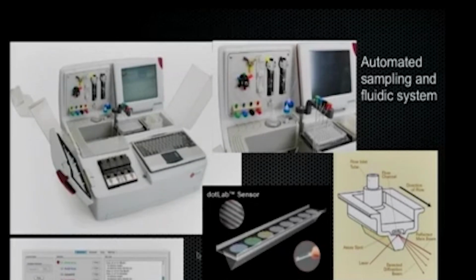And effectively in the instrument, the laser beam runs through back and forth into this. And there's a channel there. There's an insertion port, the injection port where you inject the analytes. Right. And it just goes to that little channel, which is about 20 microliters or less. But it has a pumping system, so you can actually control the flow rate and so on, which becomes important when you're doing kinetic studies.